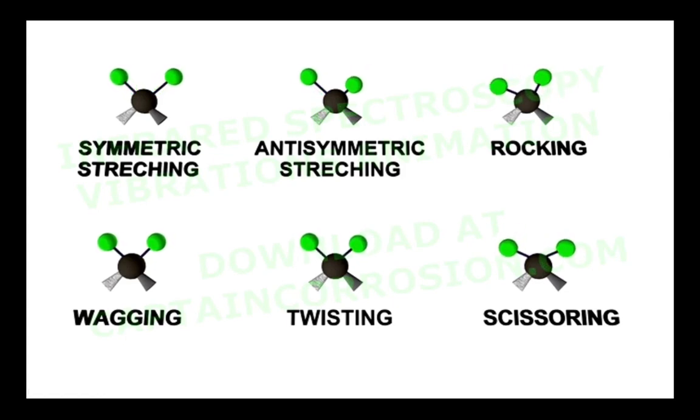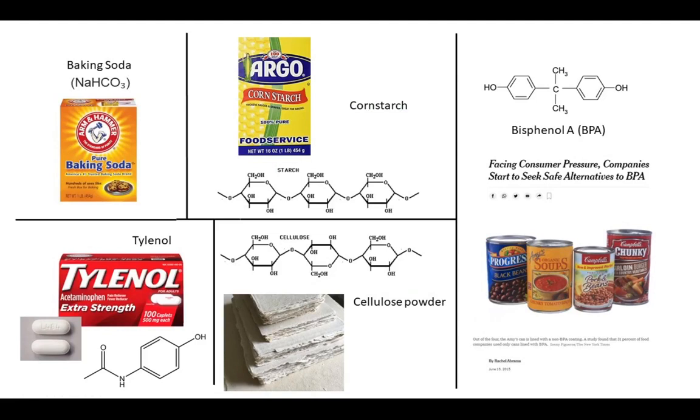Okay, so in the previous slide, I spent some time trying to animate the water molecules myself to show the dance moves, but that was not going to happen. So I stole this GIF to show you instead. Please ignore that the word stretching is misspelled. So this is a different molecule. The balls are meant to represent atoms, and the sticks are bonds between them. So the bonds are moving in different ways, as you see here.